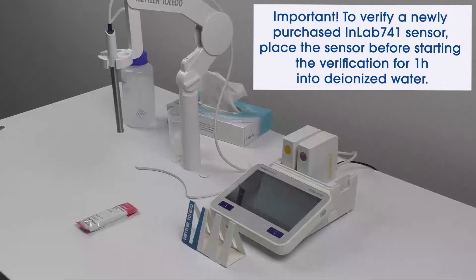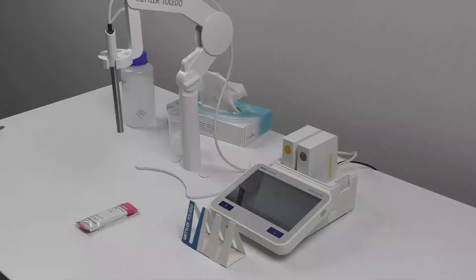Moving on to the verification of the InLab 741 ISM conductivity sensor. This sensor comes with a certified cell constant and doesn't require calibration. However, it does need verification before the first use.